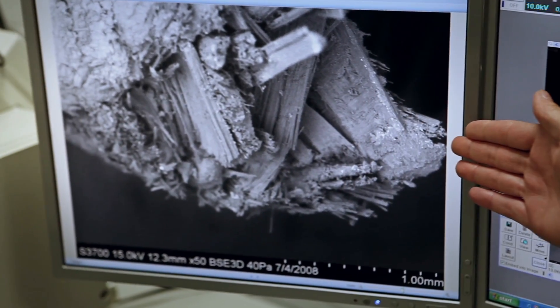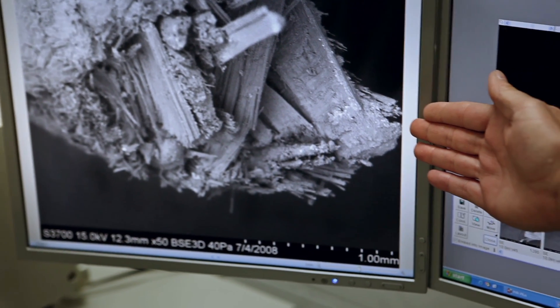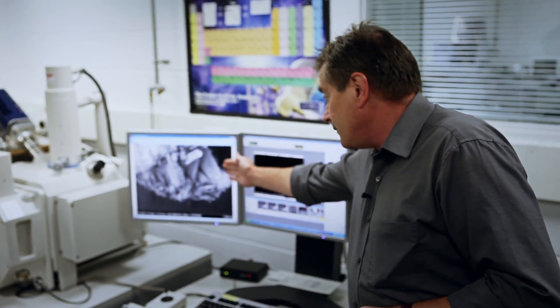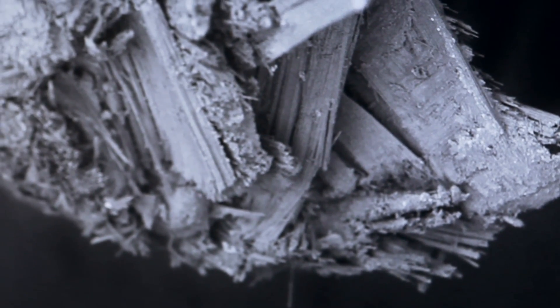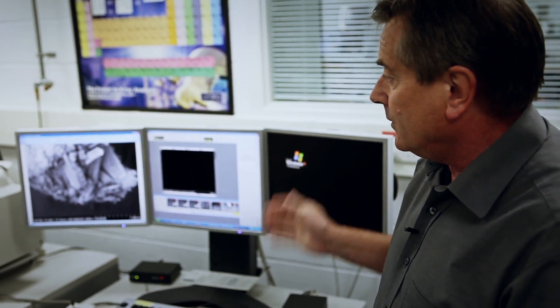On the screen at the moment you can see a carbon component that failed in the lab on a machine and that's just 50 times magnification. We can go up to 300,000.